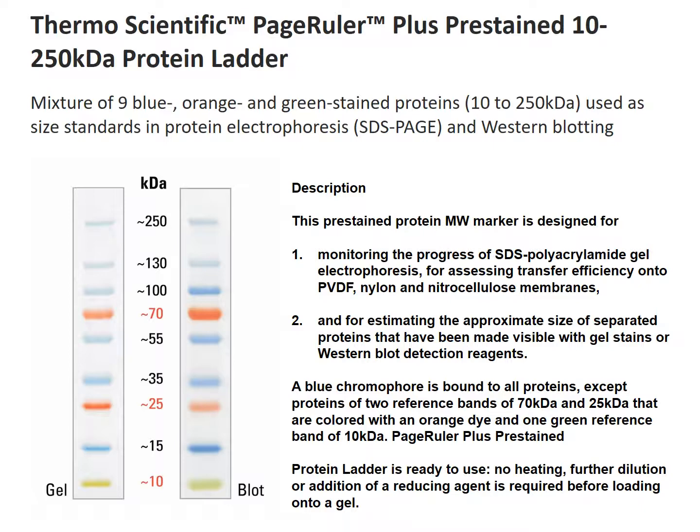Okay, and you can measure with a ruler the distance in millimeters. And now you can plot on a graph paper this molecular weight versus the distance traveled. And if you plot that, it should be a straight line. Okay, straight line. That's not straight, but straight line. And then if you have an unknown, say a protein right here, then you measure how far the protein went, and then you find the line and drop down, and that'll be size of protein versus distance here, the X and Y axis here.